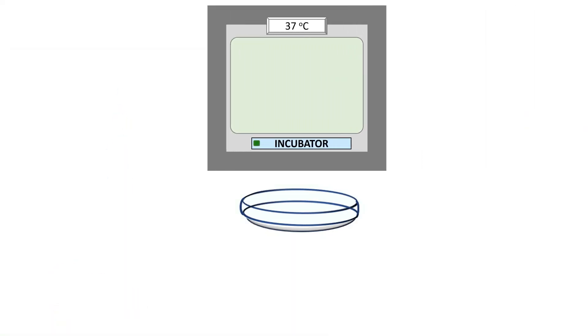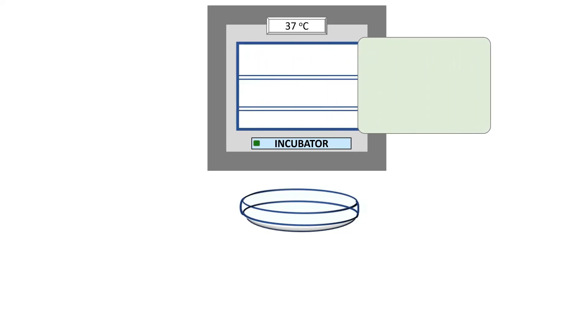Keep the petri plate in an incubator at 37 degrees Celsius for 24 to 48 hours for incubation.